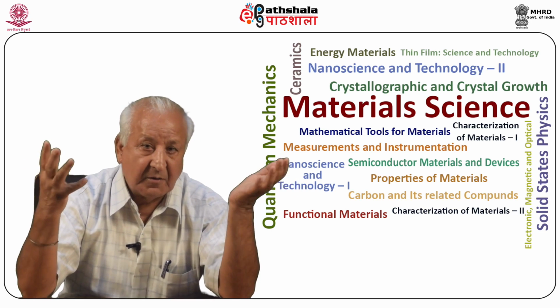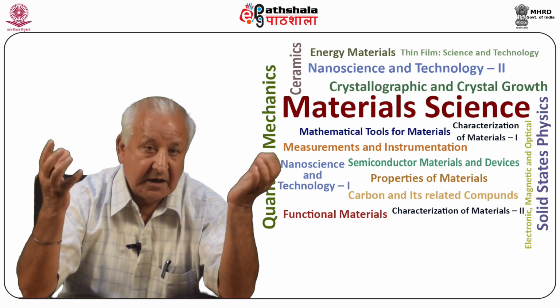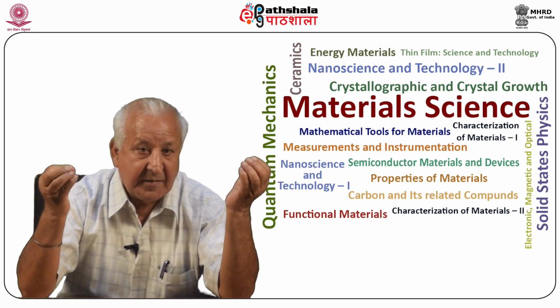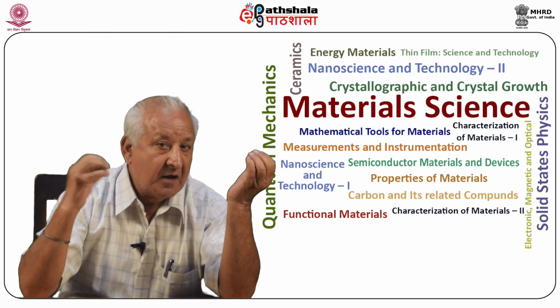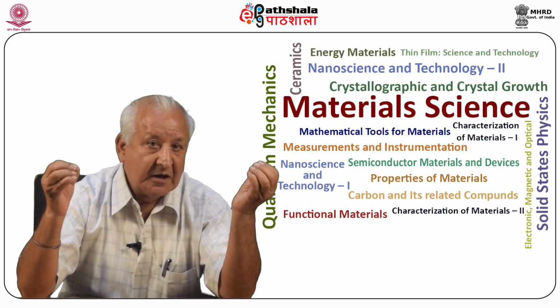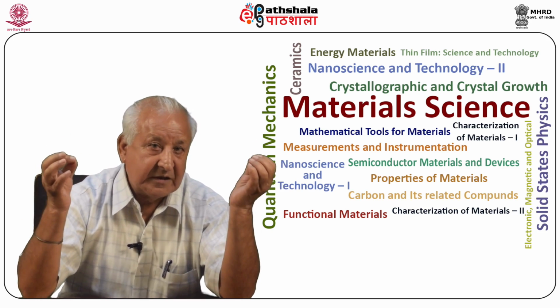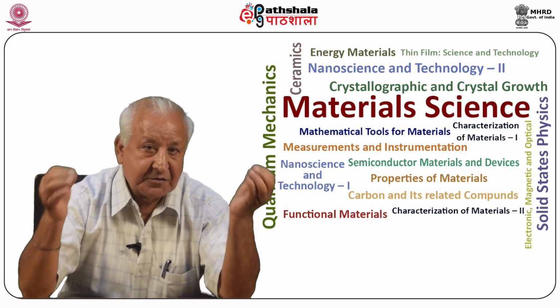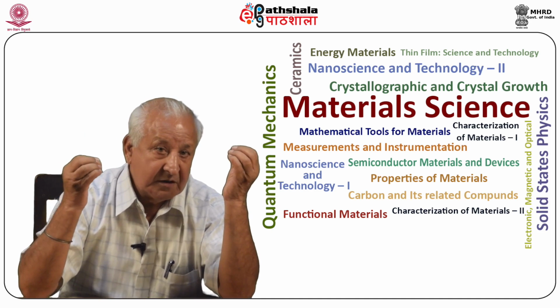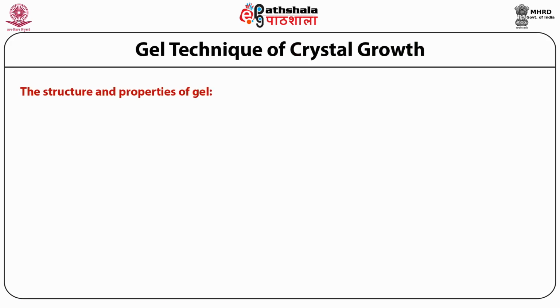The idea of utilization of gel as a medium of crystal growth was put forward by Fisher and Simons in 1926. The art and science of growing crystals in gels remained largely dormant during the period 1930 to 1960. Henisch has described the technique of crystal growth in gels in his book Crystal Growth in Gels, and another book describes that crystal growth in gels is an intermediate process between growth from solid phases and growth from liquid solutions.